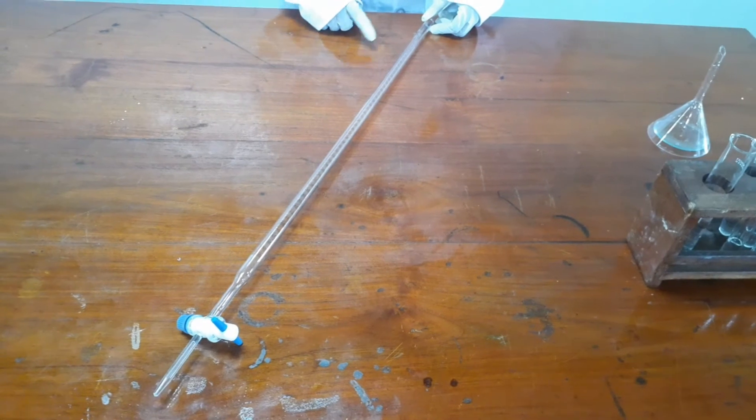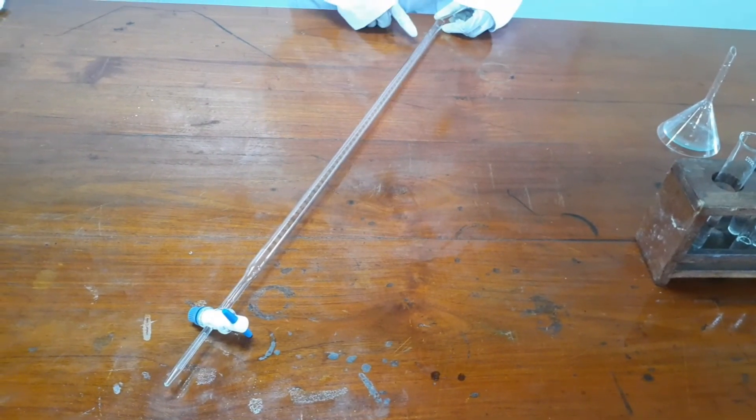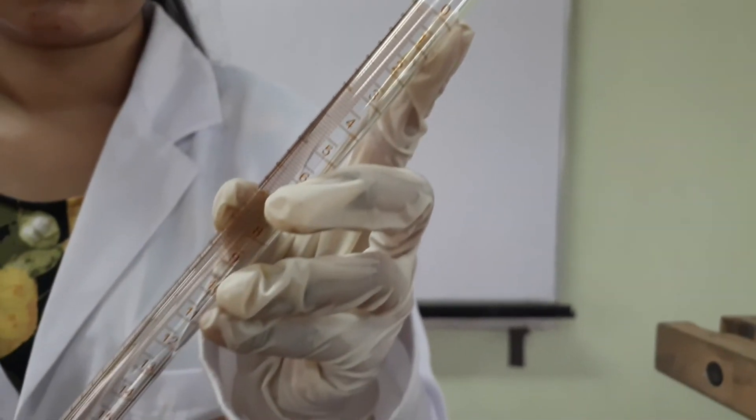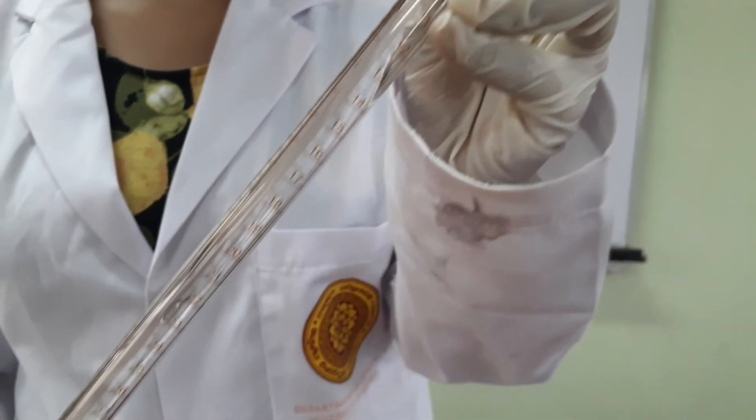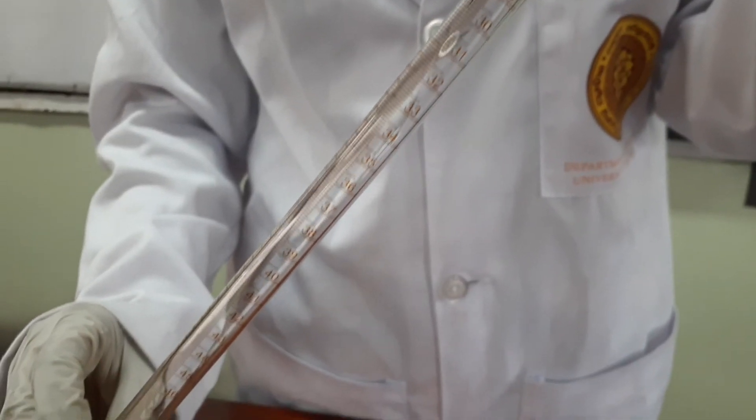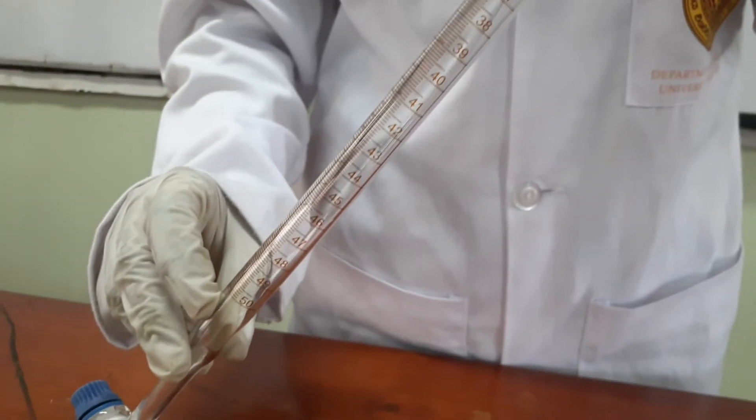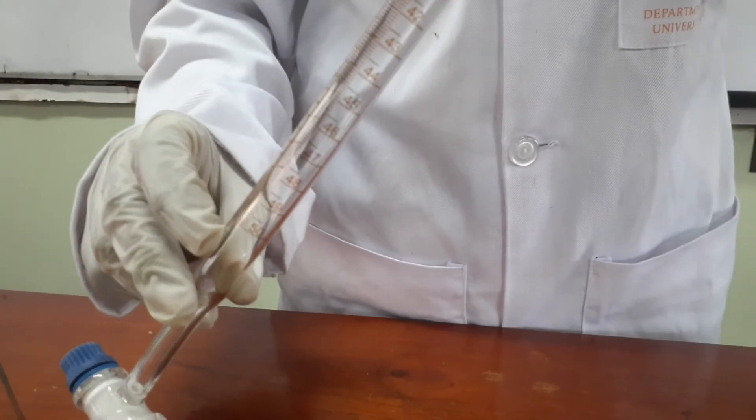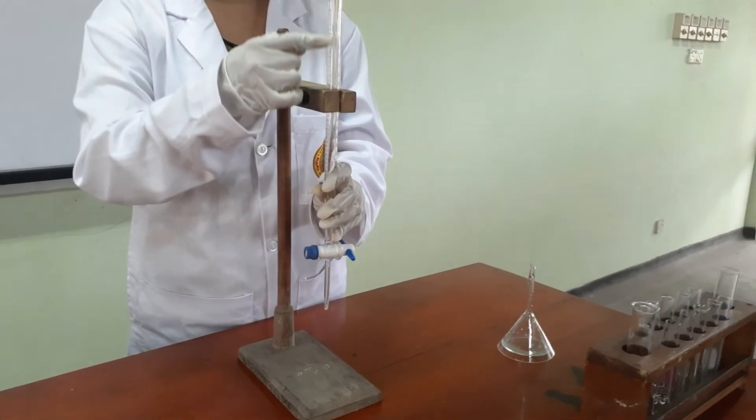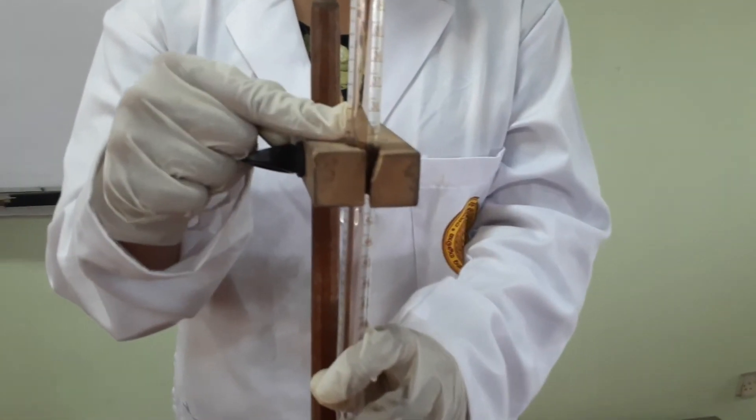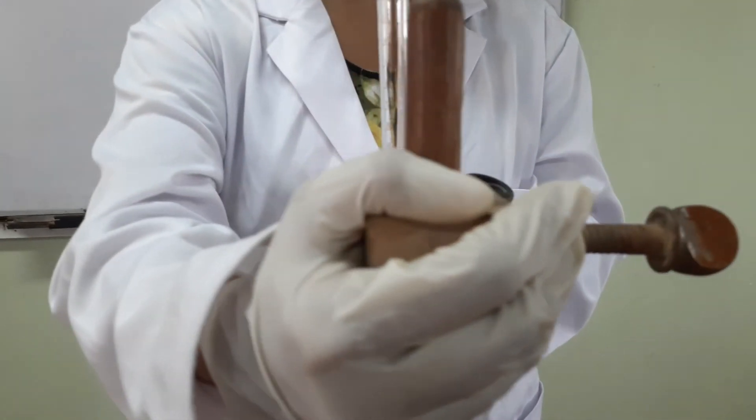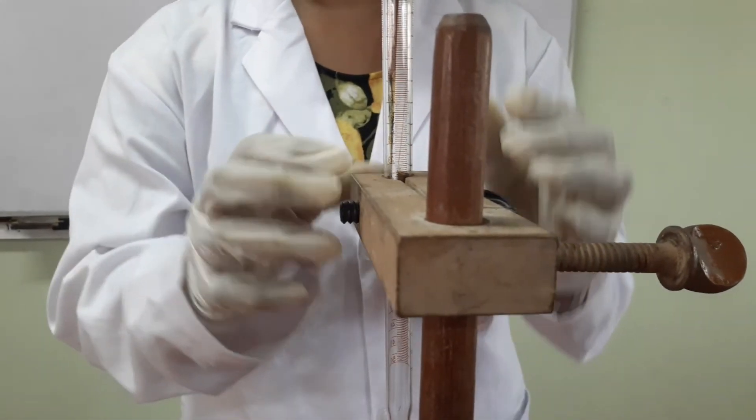Burettes. In laboratory, we use burettes to dispense and measure variable amounts of liquid in titrations. In burettes, the 0 mark is located at the top of the burette while the 50 ml mark is located near the stopcock. When filled to the 0 ml mark, the burette is saying 0 ml of the solution has been delivered. First, we must clamp the burette perpendicular to the lab bench. The burette calibration should be kept to our side. It will help us to see the amount of solution that has already been delivered.